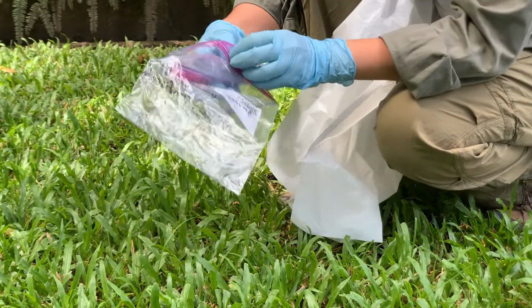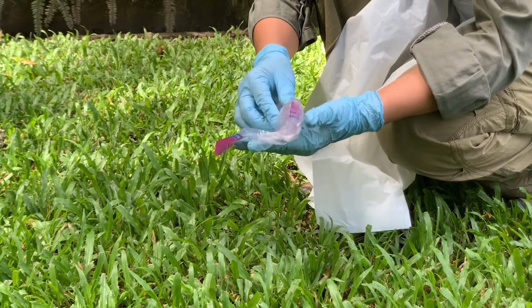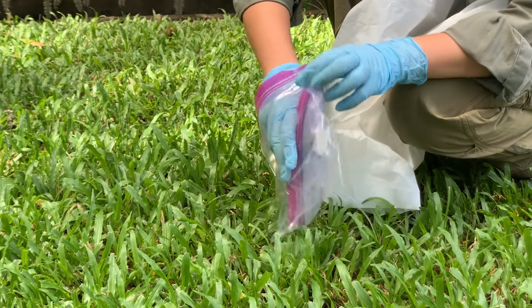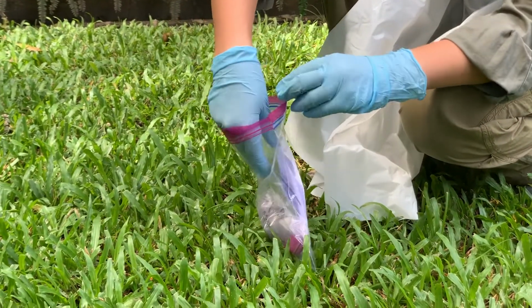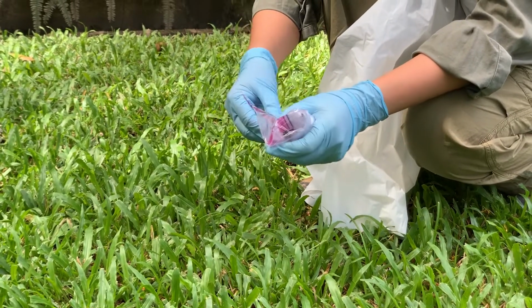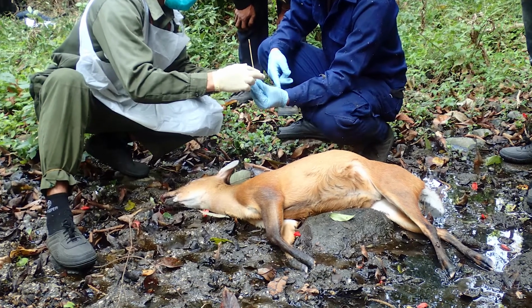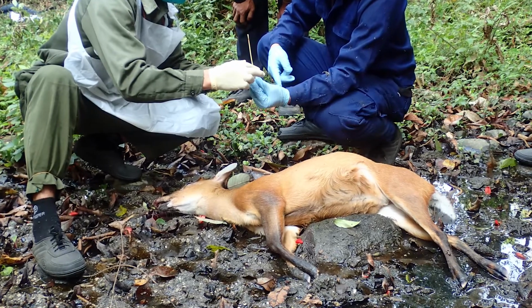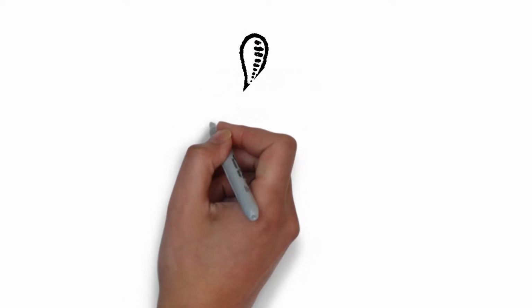Place the individually bagged animal into a second plastic bag and seal it in the same fashion. Place the second bag into a third bag. Place the completed wildlife morbidity and mortality event form into the third bag and seal the bag closed. If the animal is larger than the carcass collection bag or too heavy to carry or cannot be legally transported, collect samples instead. Swabbing. All of the necessary materials should be present in your field sampling kit.